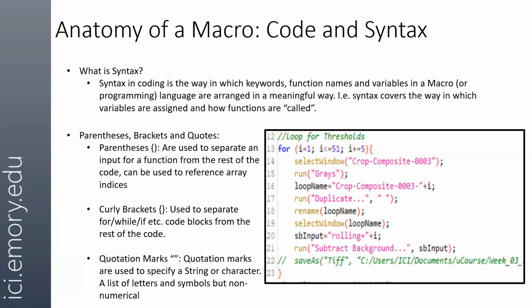In a way that's similar to mathematics, if you recall, where if you put something in parentheses, you do it before you do other stuff, under the order of operations. It does something similar in the macro language, where that comparison is done first, and also it specifies input for functions.